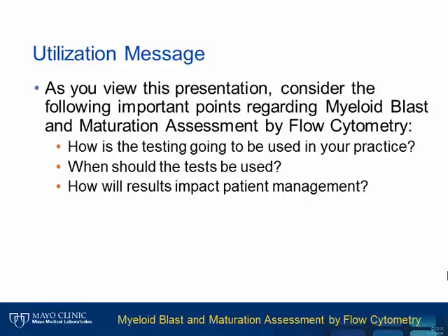How is the testing going to be used in your practice? When should the test be used? And how will the results impact patient management?